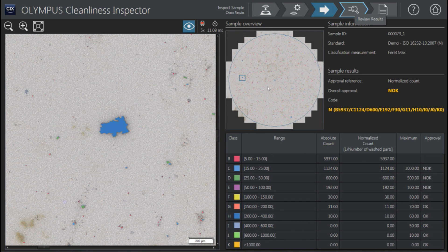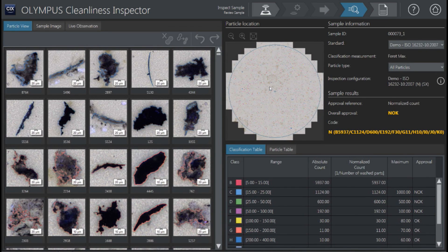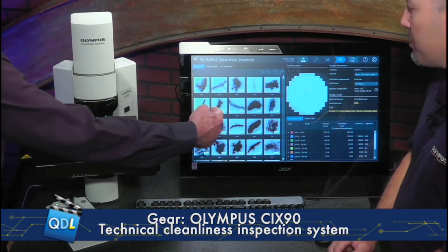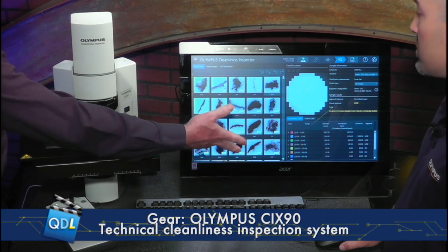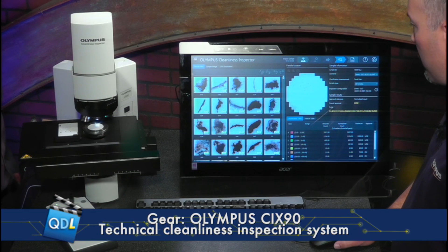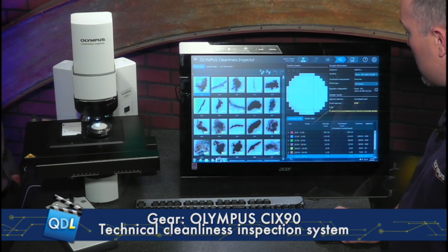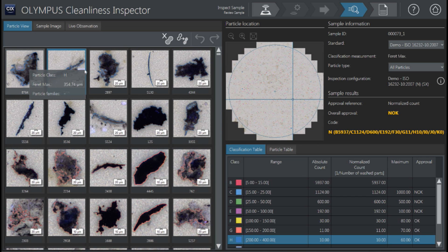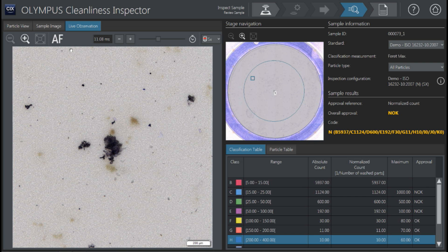Under this selection, another great feature for traceability and going back later on — every single picture of every single particle is captured here from the entire scan over the filter paper. You can filter these by particle size. If you select one at the top, not only does it show which bin it fell into as far as its sizing, but it's going to move the stage. Every one you click on, the stage will actually drive to those points. So you could actually go and physically examine that particle, switching to live observation to see it on the image screen.